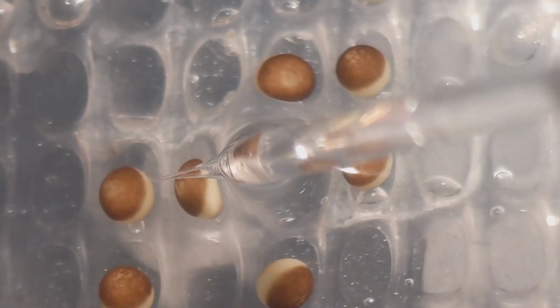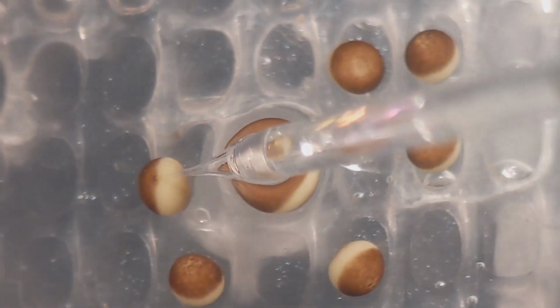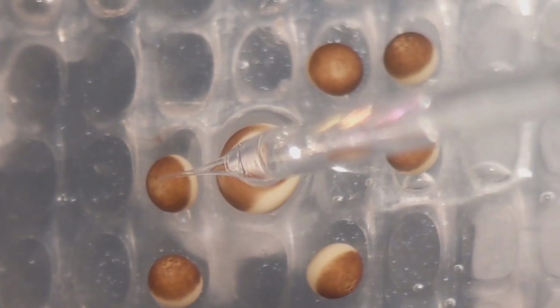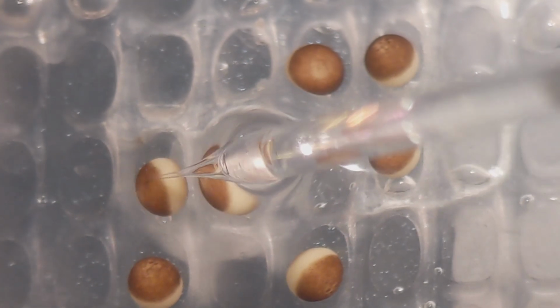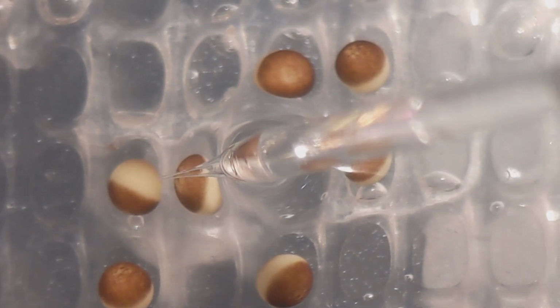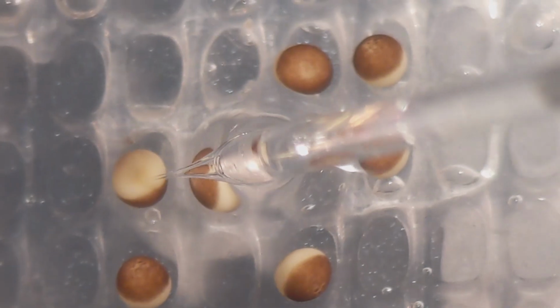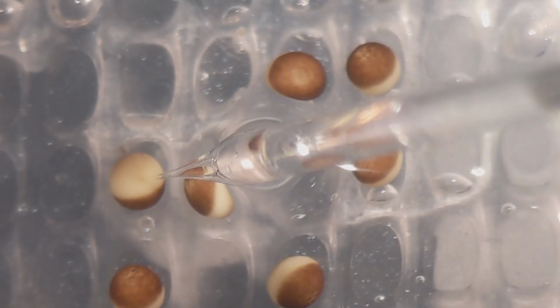Cell wall on the oocyte, not the cell, but the cell membrane. Yeah. It's just so thick. It just kind of bounces off and rolls around. It just rolls around and you're just chasing it the whole time. Oh, there we go. This is a good one.